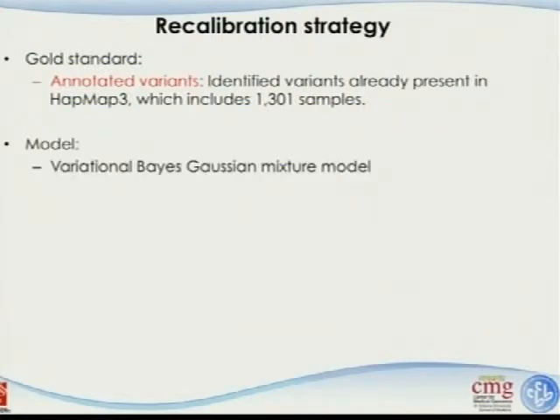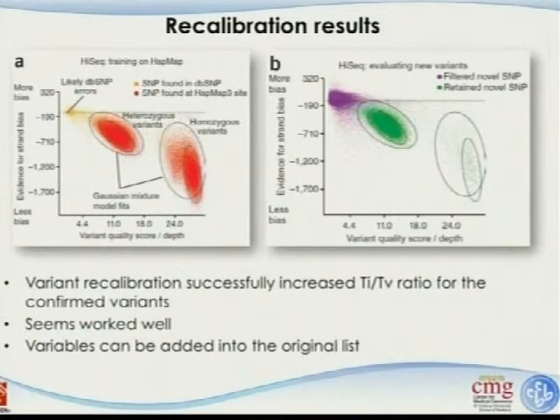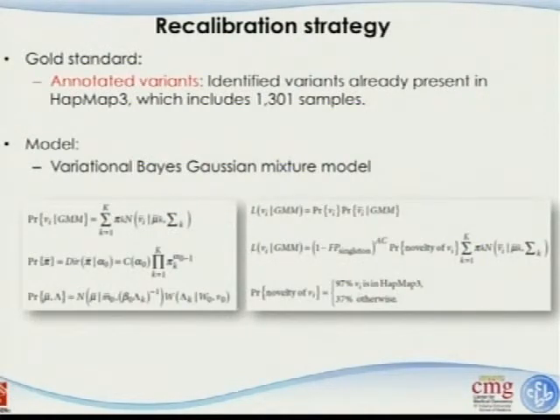And the model they use is something called a variational Bayesian Gaussian mixture model. Every time you get so many confusing terminologies connected together that don't make any sense, let's just consider it okay. I'm not going to go through that. But anyways, these are the equations.